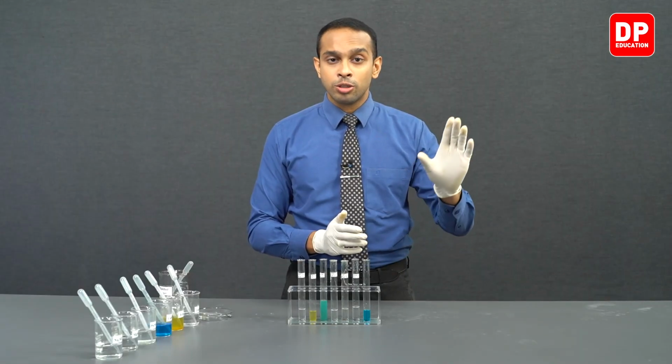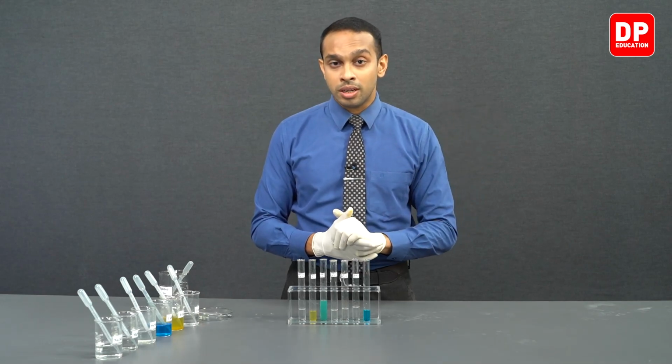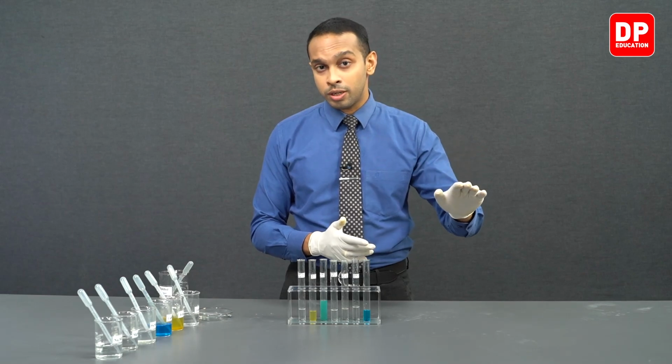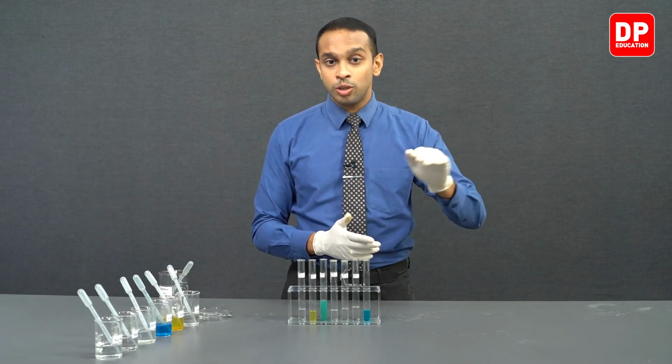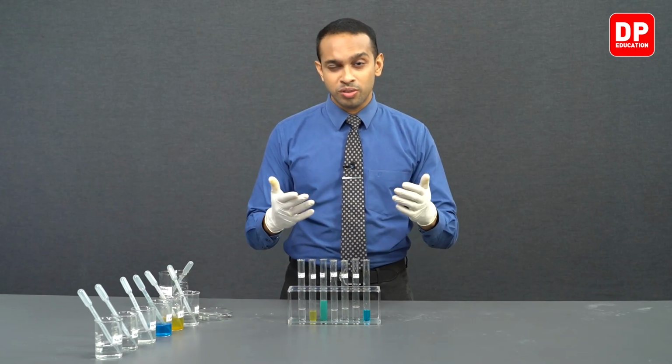Copper 2 plus ions and water ligands form a complex that is blue in color. So if you have a higher concentration of copper 2 plus ions in the medium, you will observe a very clear blue color. But if you lower the concentration of copper 2 plus aqueous ions in the medium, then you will observe that the blue color of the solution will decrease.